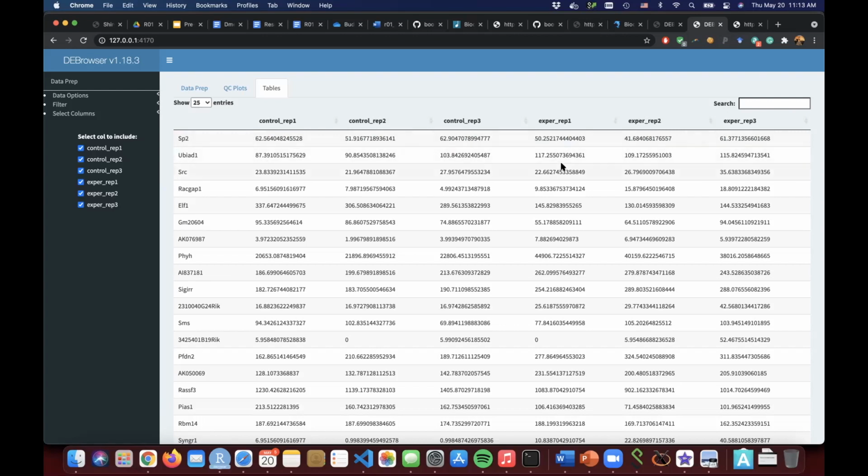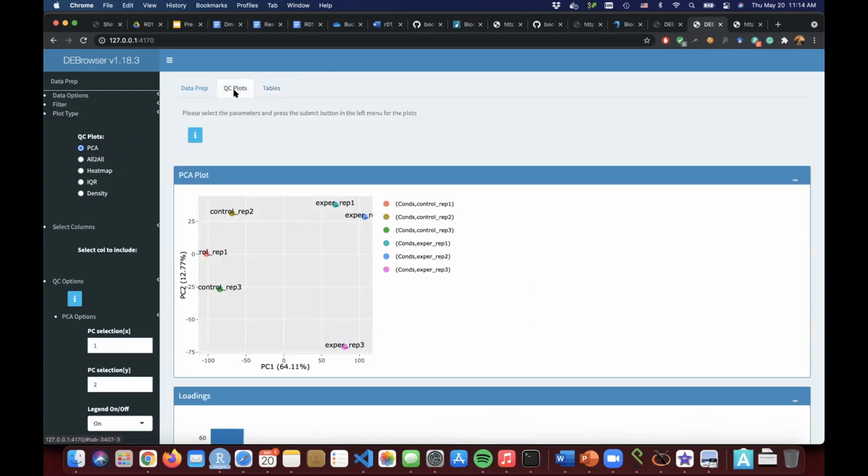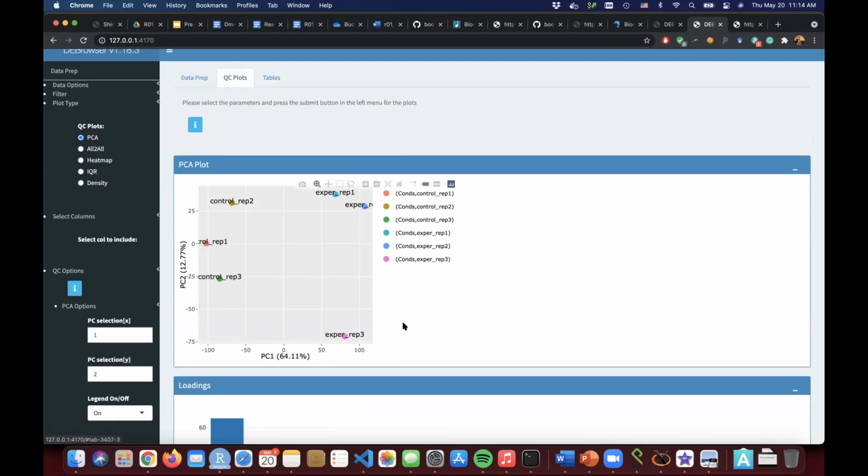Any questions there? Yeah, how did you get the scatter plot? I will show. Oh, here on plot type, sorry. I'll show. Okay. Are you talking about this plot? The scatter plot that compares each, you know, the... I'll show in a second.